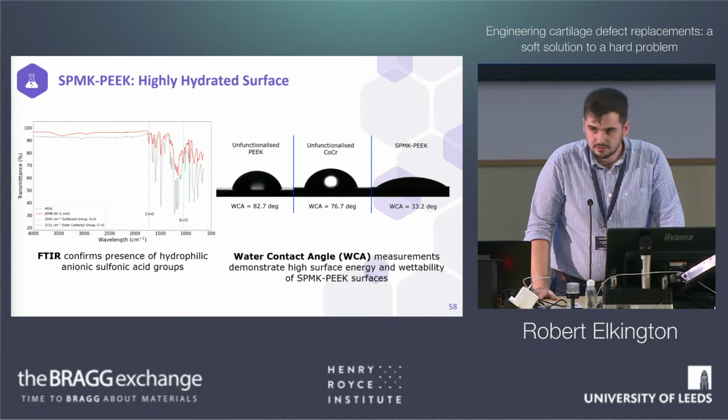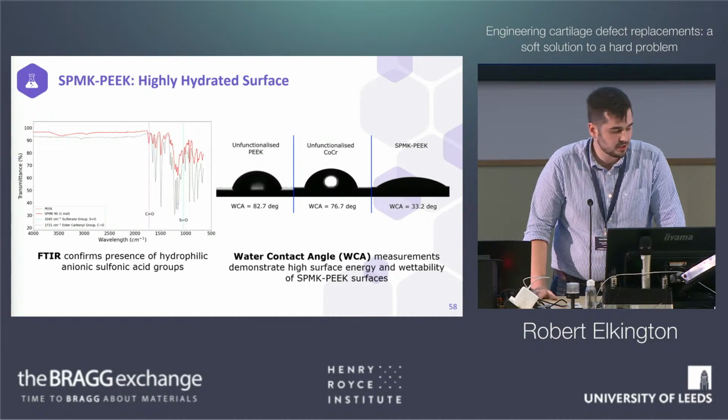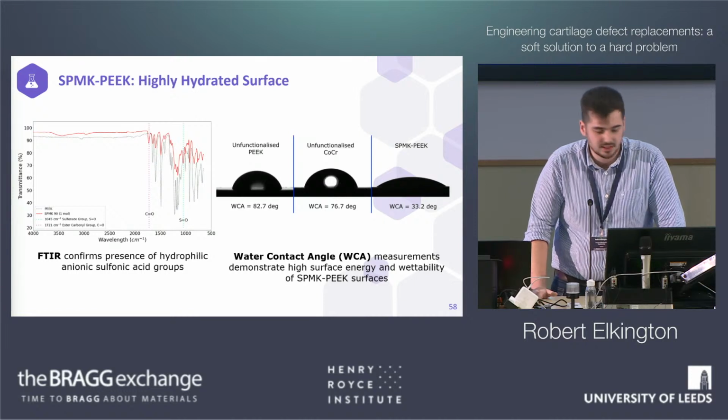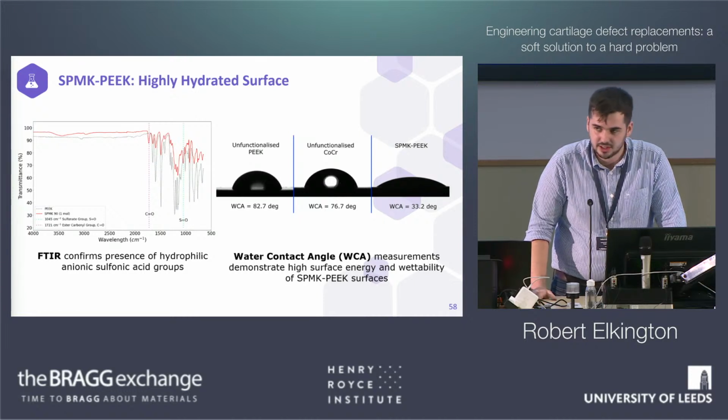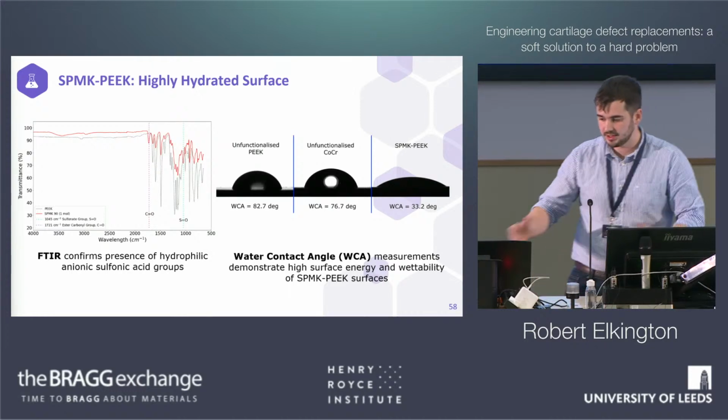And then, again, a fairly simple test, water contact angle. Starting with a PEEK substrate, not very hydrophilic, you get a water contact angle of around 80 degrees. Cobalt chrome, that we're going to use as our biomedical control, is slightly more wettable, but not great, around 76 degrees. And then with SPMK functionalized PEEK surfaces, we're really able to reduce that contact angle and produce quite a hydrophilic functionalized surface, indicating that we really increase the surface energy here.